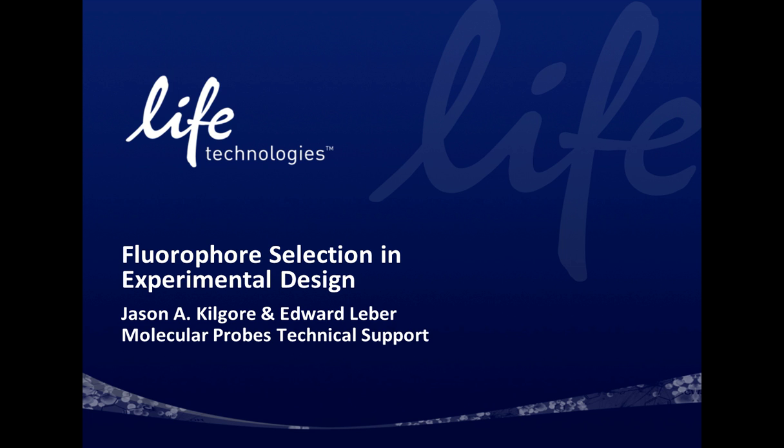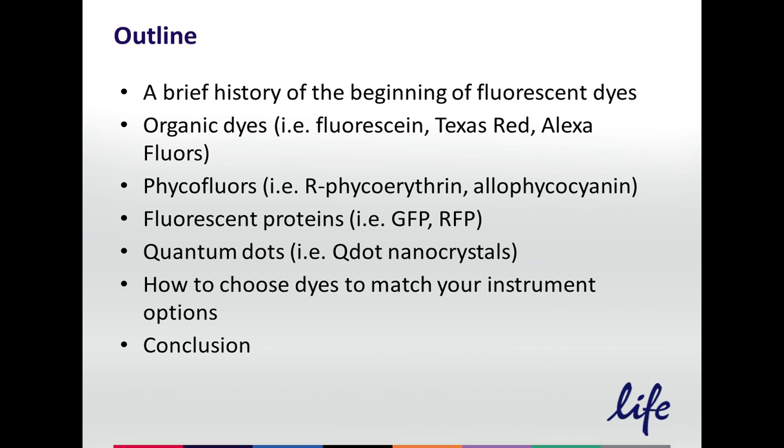Okay, let's go ahead and get started. This presentation is designed to give you a very basic understanding of 4 of the main classes of fluorescent reagents, or fluorophores. I'll start with a brief history of the beginning of fluorescent dyes and their use with biological materials.